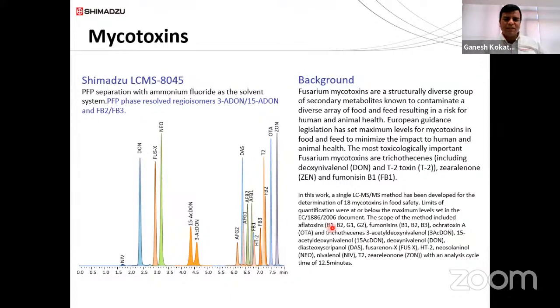Those toxins are present in our ready-made food, different food matrices, or some dietary supplements. There are n number of dietary supplements in the market, because in the last 4 to 5 years there are different products, and aflatoxins are also present there. So those can be identified with the help of this analysis on LCMS.